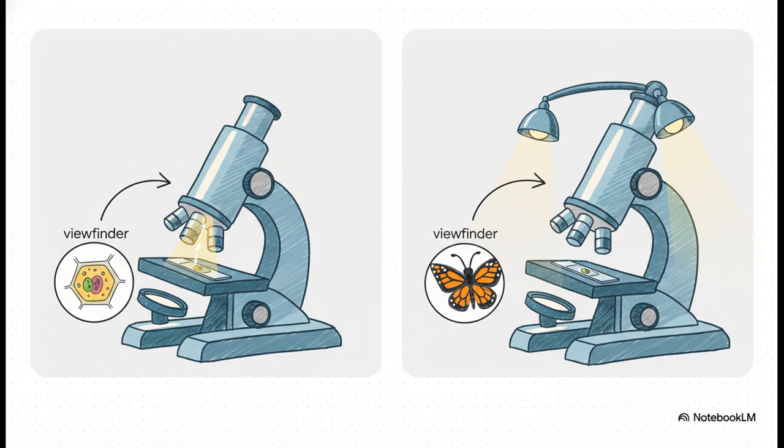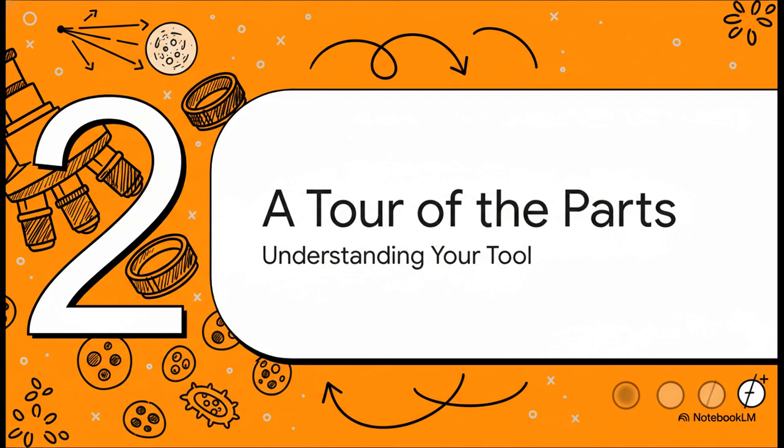Simple as that. Okay, time to get up close and personal with the compound microscope. Knowing what each little part does isn't just trivia, it's totally essential for getting a perfect image without all the frustration. So let's start the tour.